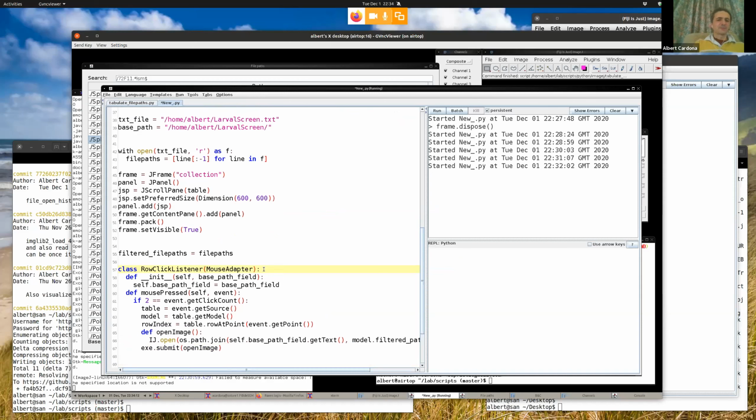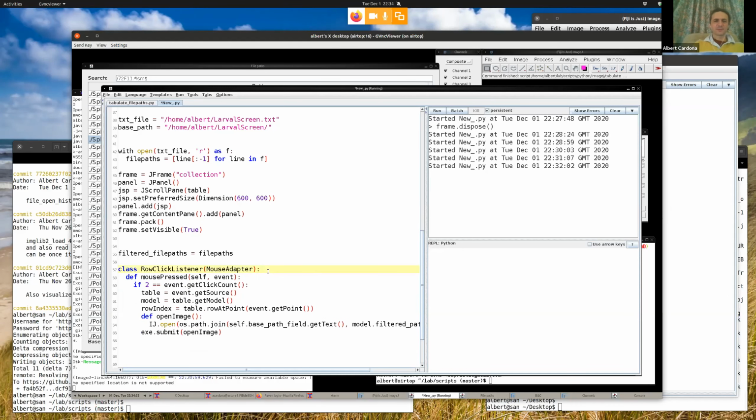And then this mouse adapter is essentially a mouse listener that has all its methods implemented for mouse clicked, mouse pressed, mouse released, etc. I don't care about the other ones. I only want the mouse pressed. And therefore, the adapter basically provides already empty implementations for every method of that listener interface, right? Then I don't need to have a constructor here. I was being too much of a purist in there.